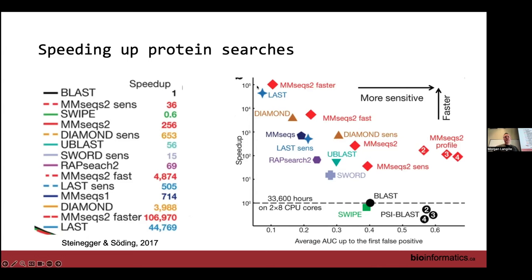That's a lot. But again, sometimes like the other systems, searching against them does let you play a little bit with their system as well. And the other cool thing is they'll often let you sort of see, oh, this gene has also been found here, especially if it's an environmental sample. So if you're studying oceans or something and this gene seems to be of interest, oh, someone else also found this here. And so that's really cool.